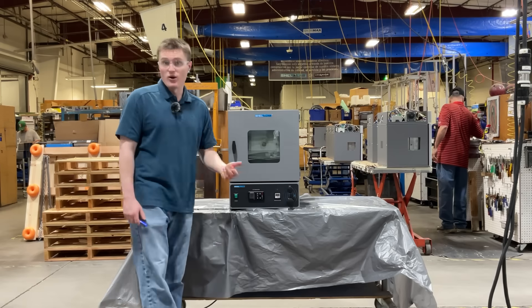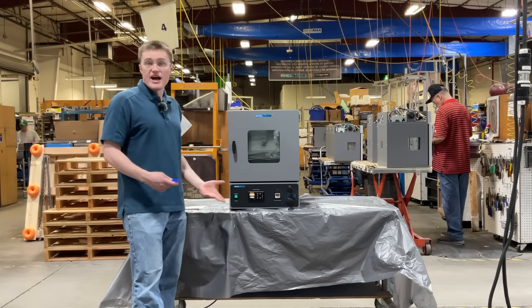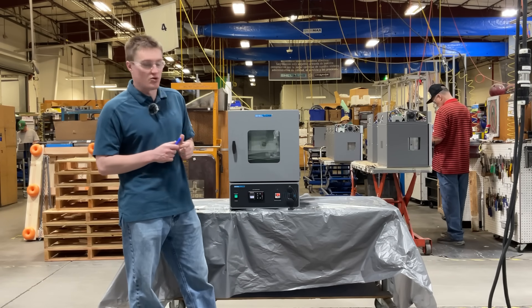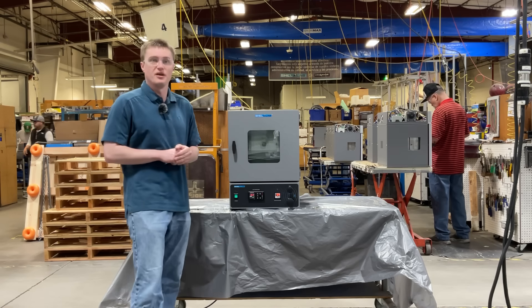After connecting the unit to power, it's ready to be turned on. After a moment, the control becomes available. The SVAC series now uses the new Wattlow PM9 Plus control. For information on how to program and generally use these devices, please refer to our website for an instructional video.